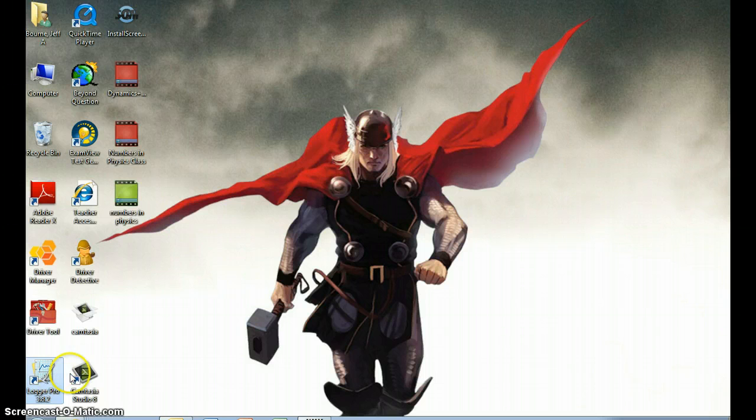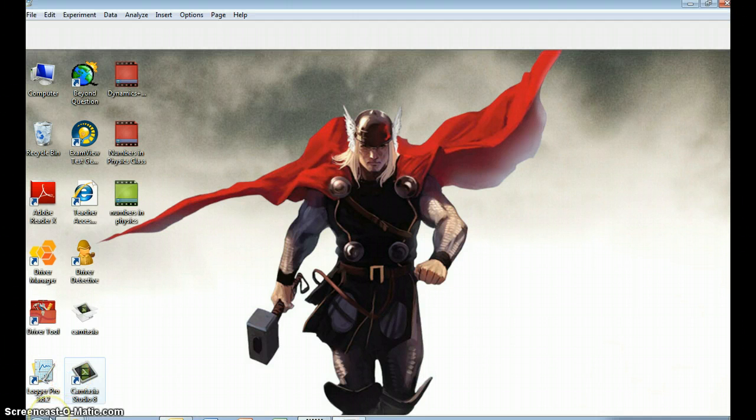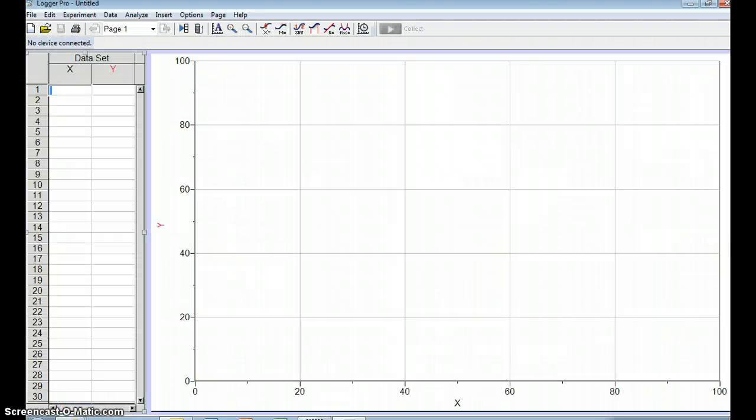and this may take a moment. Depends on maybe how many times you've used it, but it should open up here any moment. All right, well, you notice this is just a blank.